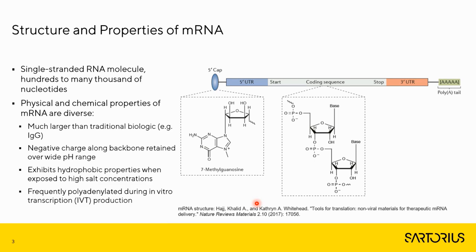And the way that we look at the mRNA molecule is in a threefold way, basically. First is that the sequence is correct, of course, and that the two key features are correct: the 5' end, the cap, and the 3' end, so that it's polyadenylated. Those are the sequence considerations that we're concerned with.